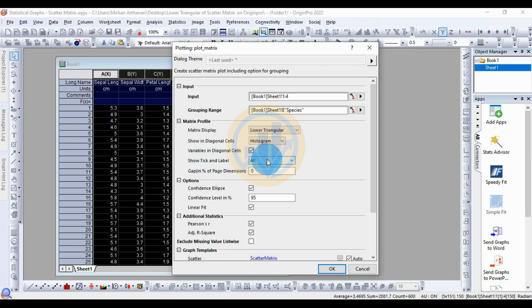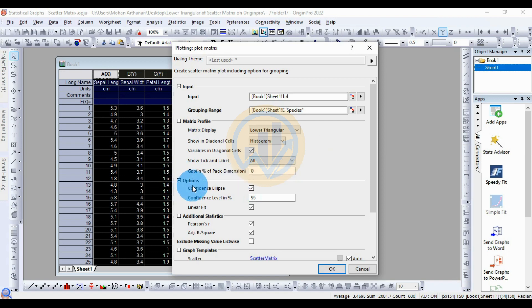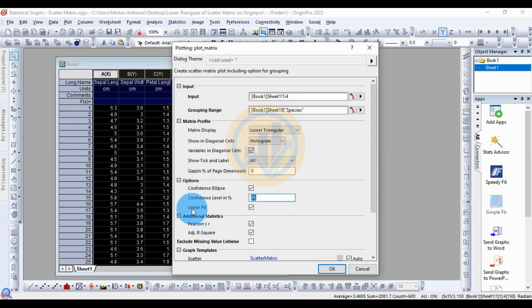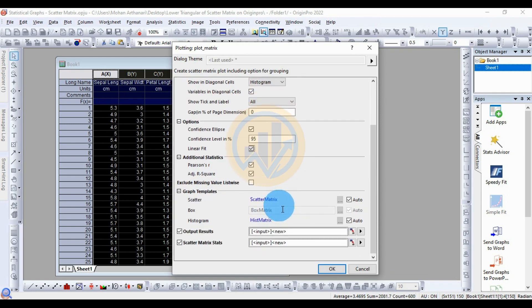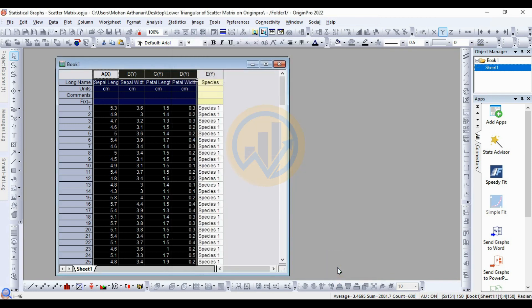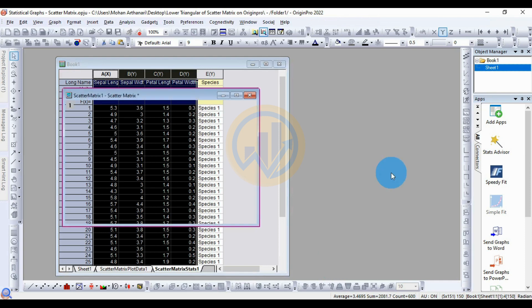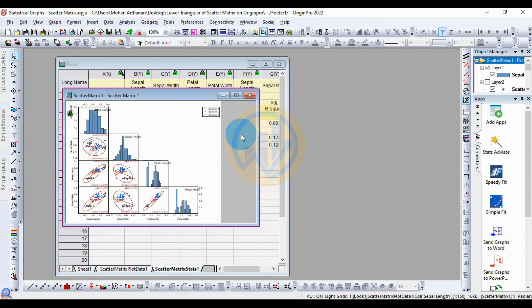Enable the option to show tick labels. For the confidence ellipse, check the ellipse checkbox and set the confidence level to 95%. Also select the linear fit checkbox. Under additional statistics, select the checkboxes for the Pearson r value and adjusted r-square value. Then click OK.